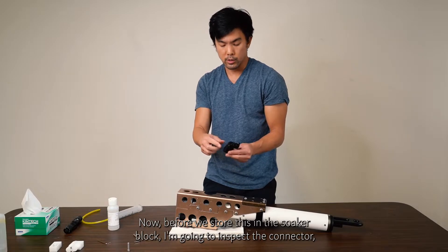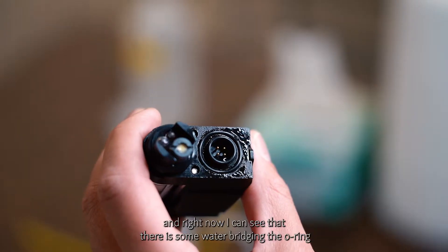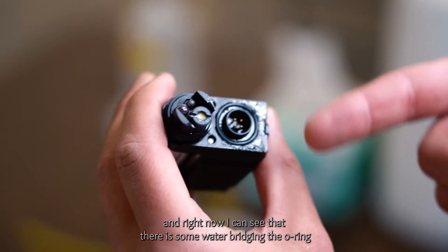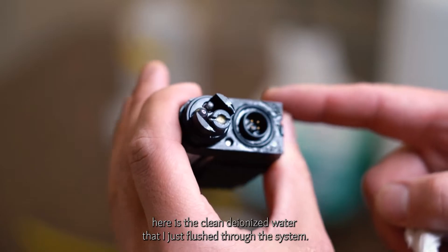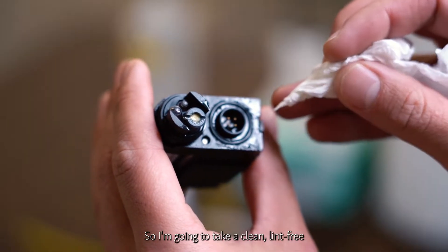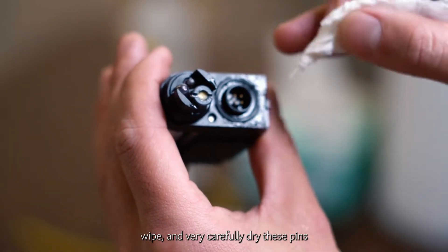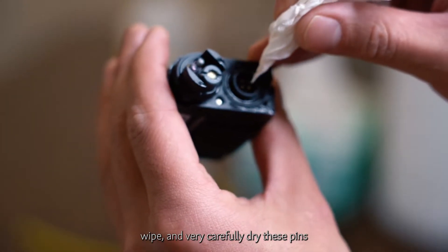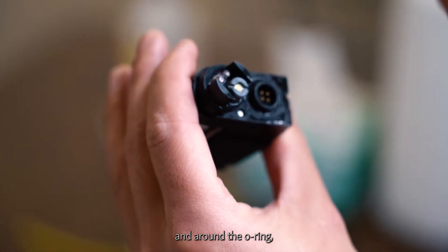Before we store this in the soaker block, I'm going to inspect the connector. I can see there is some water bridging the O-ring and some water around the pins — that's okay. This water is the clean deionized water I just flushed through the system. I'm going to take a clean, lint-free wipe and carefully dry these pins and around the O-ring.